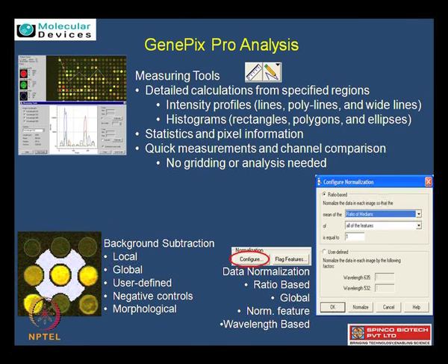Okay. So once you have the results in place in different formats, sometimes you require a measuring tool, but usually all commercial and even academic software give the GAL file details, so you really need not do it manually. But in case you want to, you can do it. Right. And then I guess there are various parameters one needs to look for while performing good scanning and acquiring the data, including the background subtraction and how to normalize the data, right? Can you just elaborate on these?